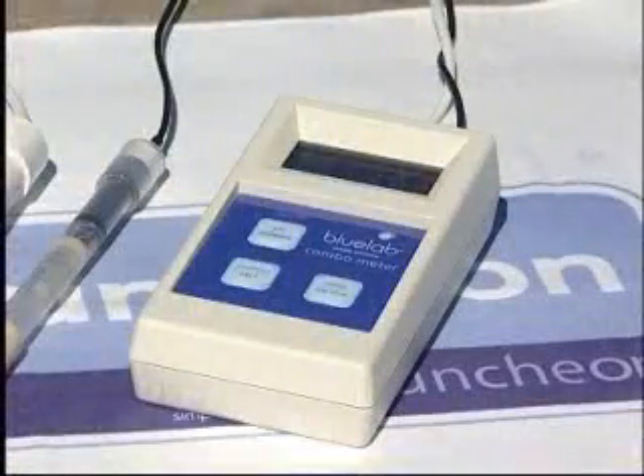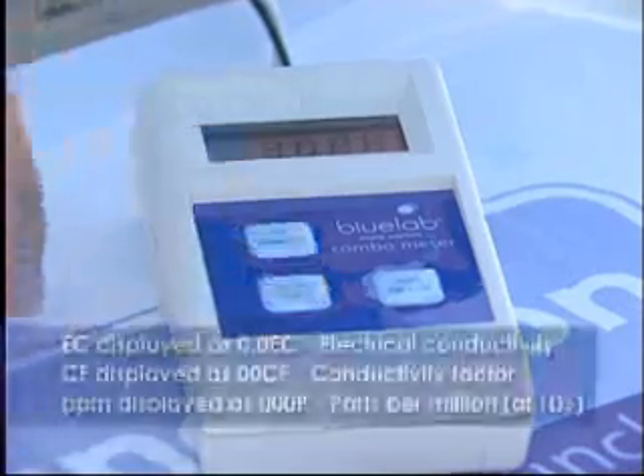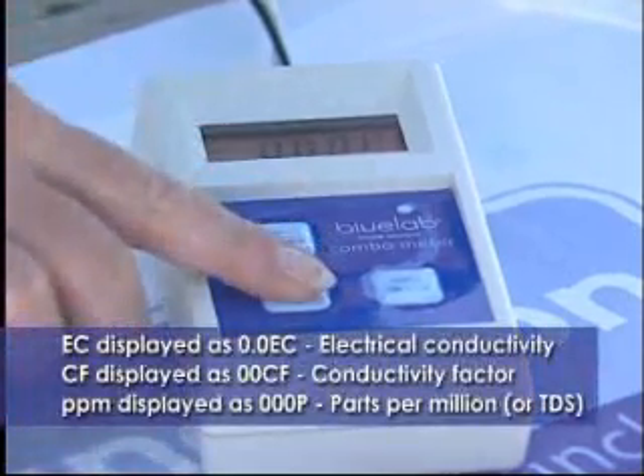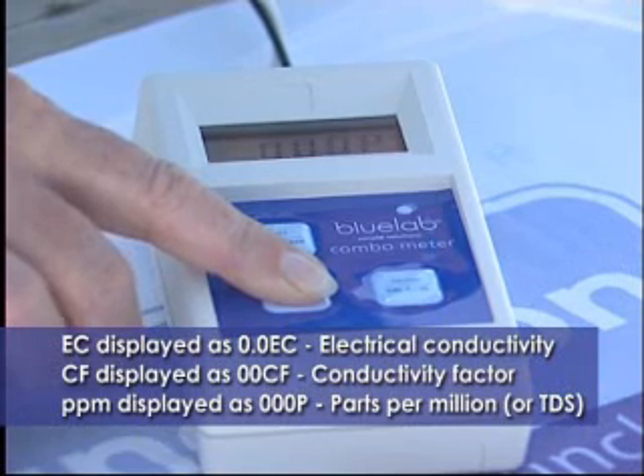Setting up the combometer to measure using the appropriate scale is simple. With only three buttons on the unit, you can't go wrong. To preset the desired conductivity scale, hold down the nutrient button until the on-screen display flashes, then release.